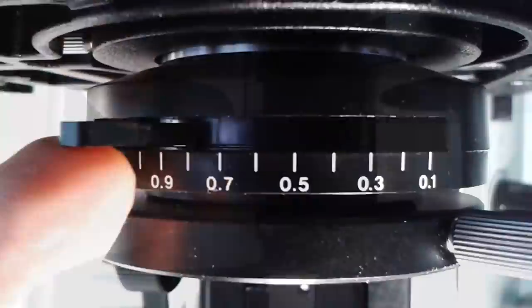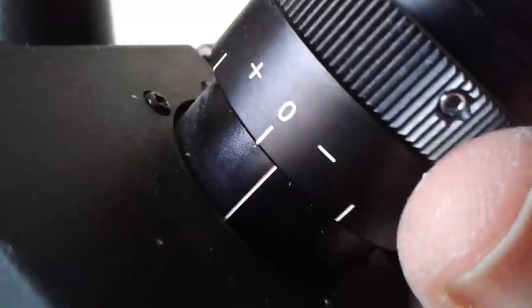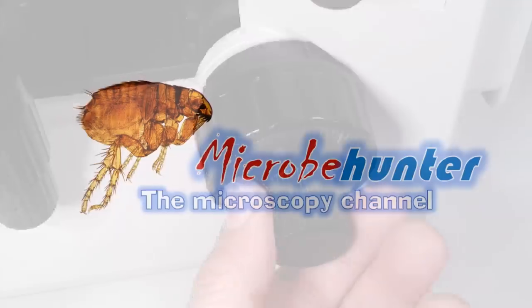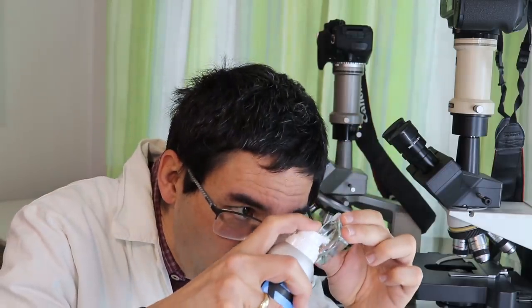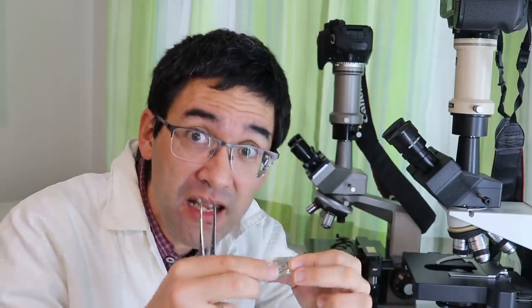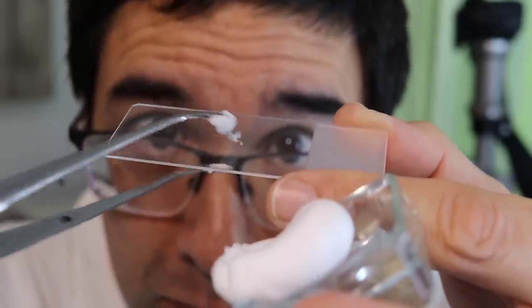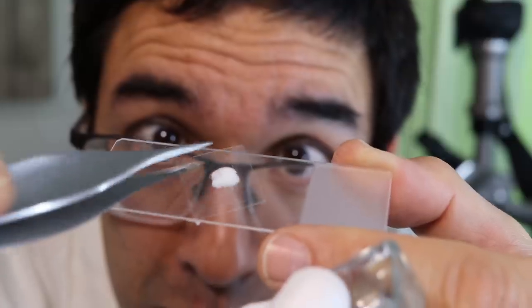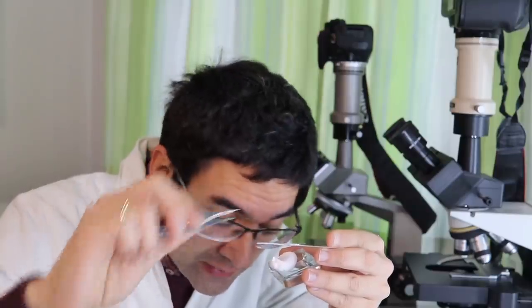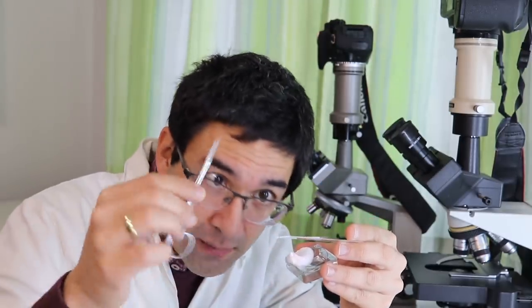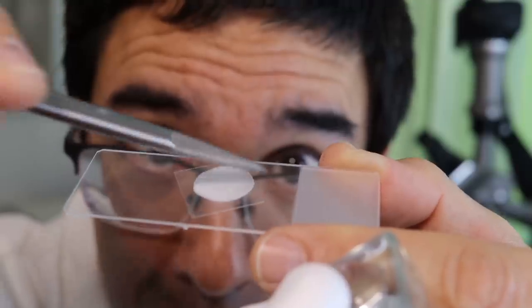Shaving foam is a really nice and simple specimen to observe. What beginners usually do is take some kind of glass dish, fill it up with shaving foam like this, take a slide, and using tweezers they try to transfer some of the shaving foam on the slide. Then they take a second pair of tweezers, the cover glass, and put the cover glass on top of it. Then they try to position the cover glass, then they take, I don't know, maybe some scissors and they try to press the cover glass on the foam like this. And this is way too complicated.